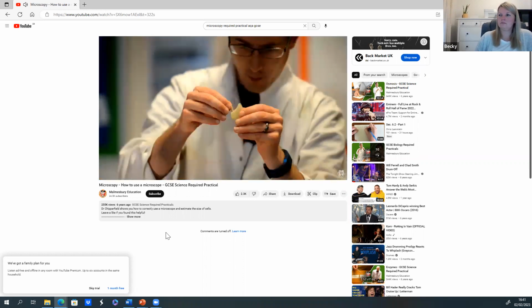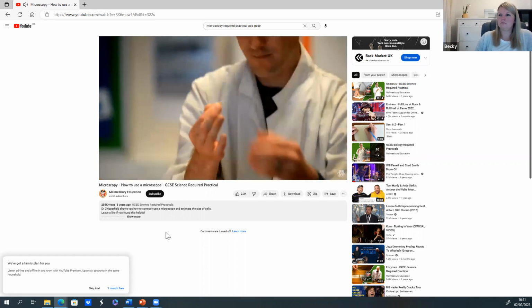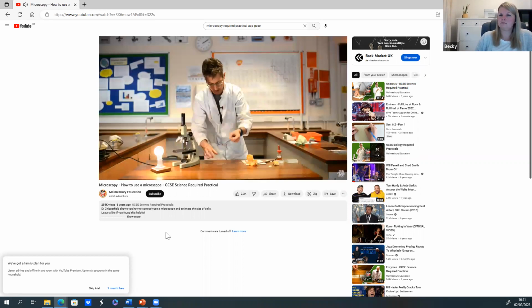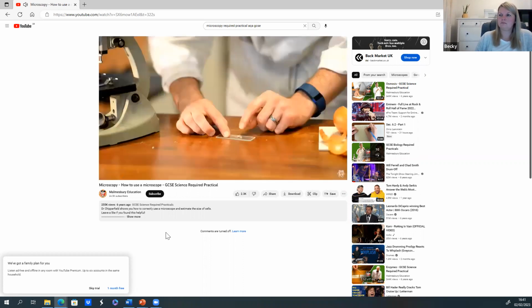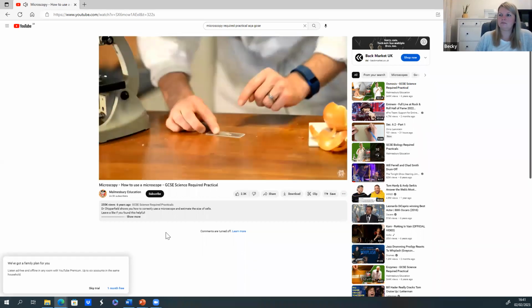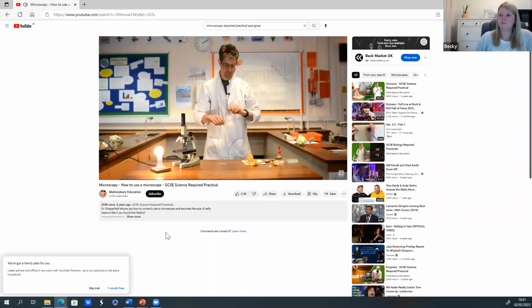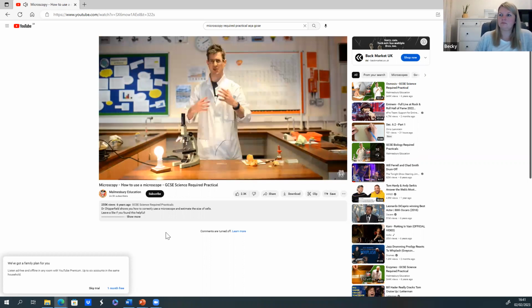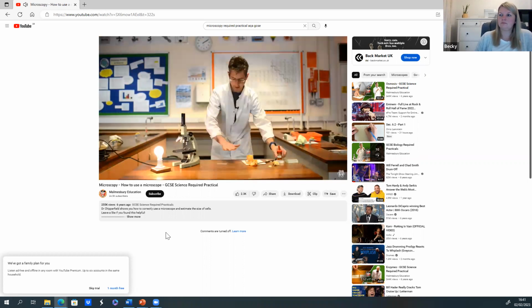Here we go, I pulled a very thin layer. That is a single layer of cells. So we've a very thin layer of tissue there. Lay that on your slide. Try and spread it out to avoid any folding or creasing of the sample. Again, it'll make it easy to see. Under the microscope, if there's any creases or folds of the specimen, you'll have 2 layers of cells underneath the microscope that you can see, which confuses what you're seeing. So try and get a nice even layer out.